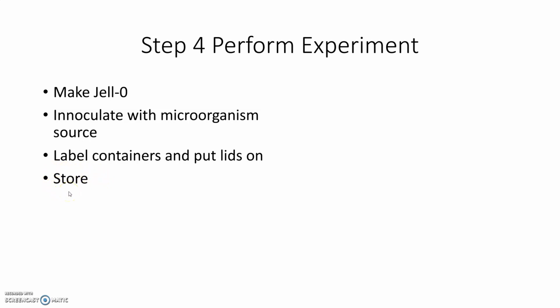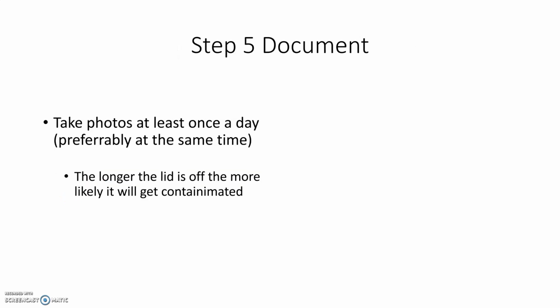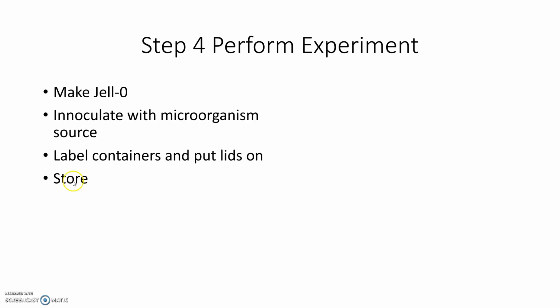But store it in a place that your parents think it's cool. You don't want it on the dinner table. And then you're going to document it. So you let it set, and I will say the jello does take a few hours to set. And you want that to kind of set before you do anything. So keep that in mind.